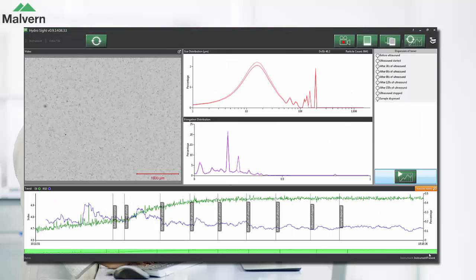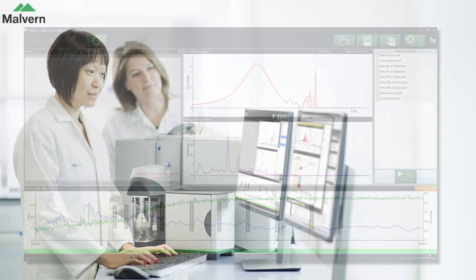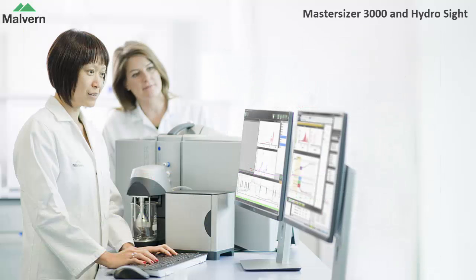This video has shown how the HydroSight accessory for the MasterSizer 3000 enables you to visualize your sample and how it can be used as an aid to method development for laser diffraction.